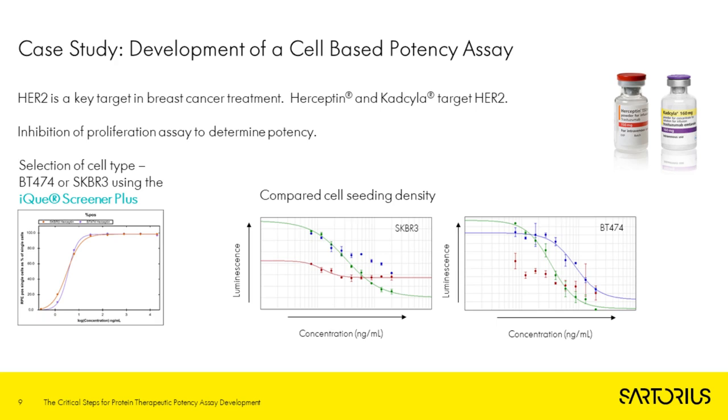So for those of you who aren't familiar with this assay, it generally takes an extended incubation period, meaning it does need to be quite tightly controlled. So for this example, I'm just going to show a couple of key steps to give an idea of the development process that we went through.